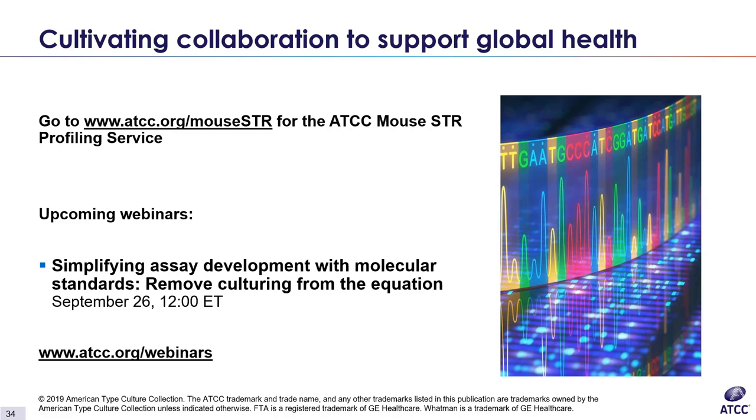That's a good point. It is very important to mix the cell suspension or DNA prior to spotting on the card. Most importantly, with the cell suspensions, if you are not mixing just prior to spotting, the cells may fall out of the suspension and accumulate at the bottom of the tube. This really decreases the chance that the cells will be picked up when pipetting onto the card. So when our biologists go to analyze these samples, they may not get a profile or just a partial profile, since there wasn't enough DNA or cells on the card. It's kind of like when you're counting cells in general, right? You want to mix them up really well first. Yes, yes. Okay, cool.